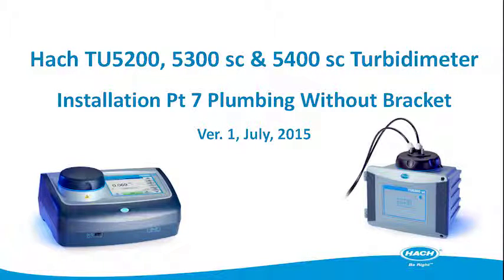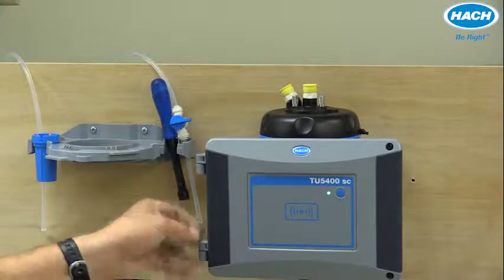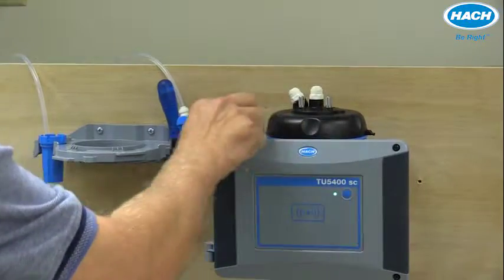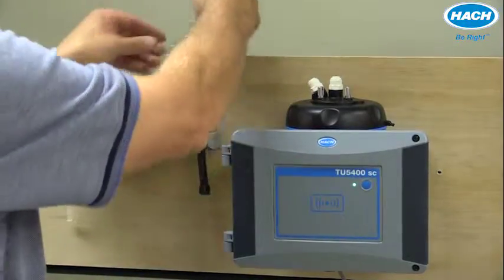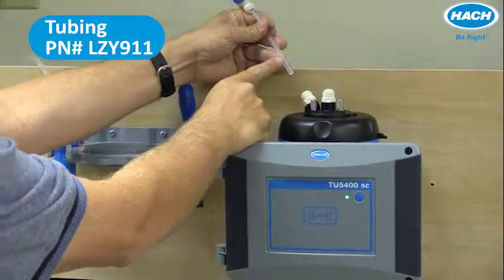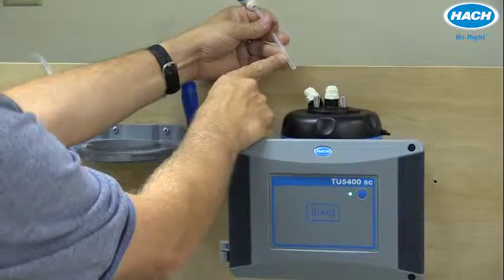To complete plumbing of the process TU-53 or 5400SC instrument, remove the yellow caps that allow access to the inlet and the outlet connections to the flow cell, then route and connect quarter-inch OD tubing. This tubing should either be polyethylene, polyamide, or polyurethane.